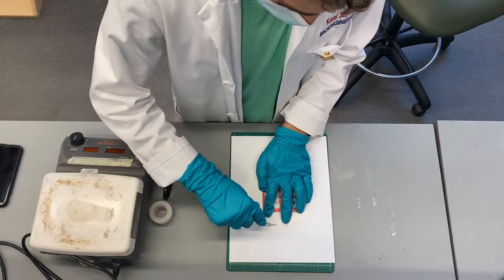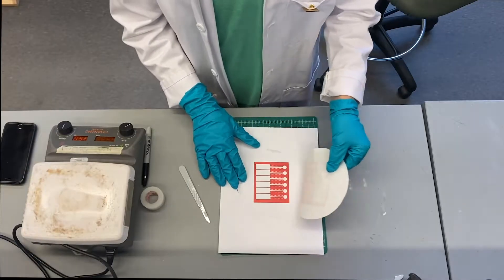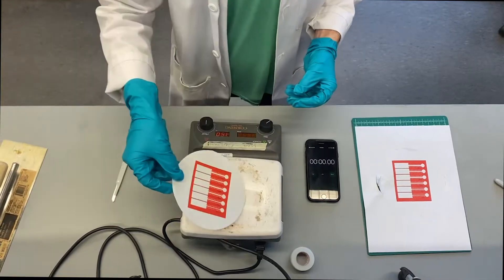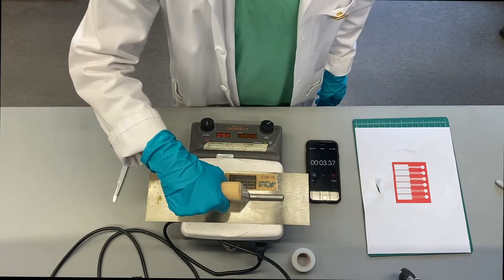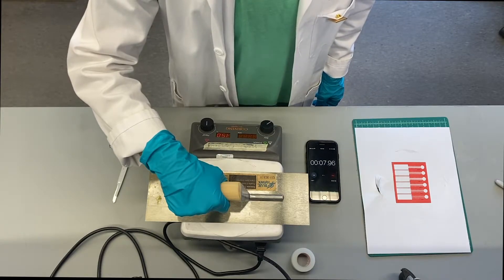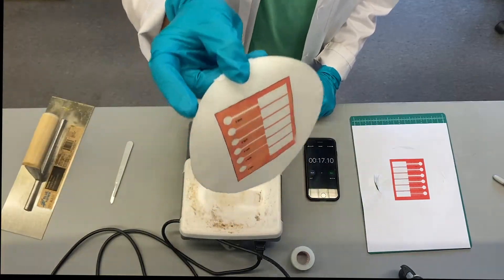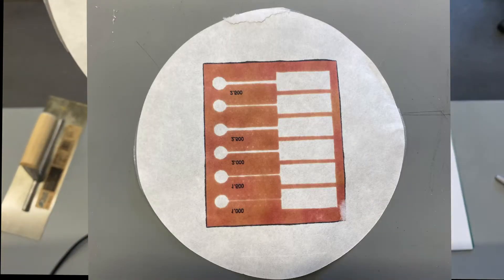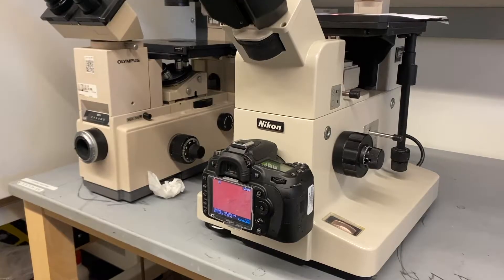Bake Microfluidic Device: The device will be cut from the alignment paper using a scalpel. The paper will be baked, waxed side up, on a hot plate at about 150 degrees Celsius for about 15 seconds. The metal trough will be used to evenly apply pressure. The wax should permeate completely to the other side, and the channels will be inspected once again to ensure they were not blocked during the baking process.